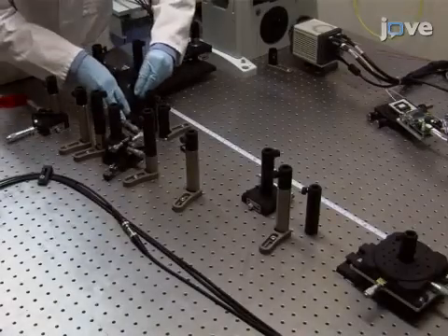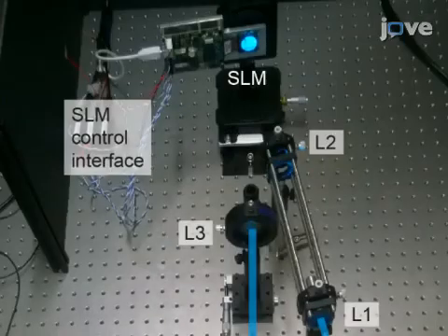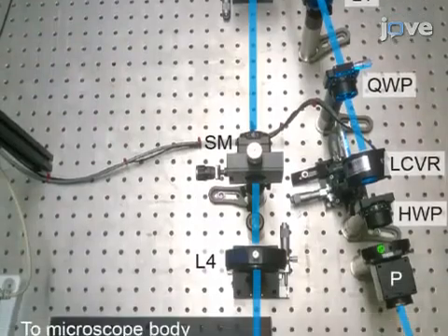To arrange and align the excitation path for a structured illumination microscope, begin by marking the positions of the components on the optical table, as indicated here.